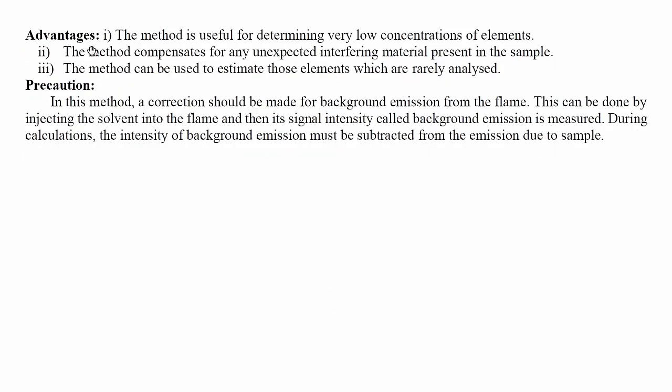Advantages: 1. The method is useful for determining very low concentrations of elements. 2. The method compensates for any unexpected interfering material present in the sample. 3. The method can be used to estimate those elements which are rarely analyzed.